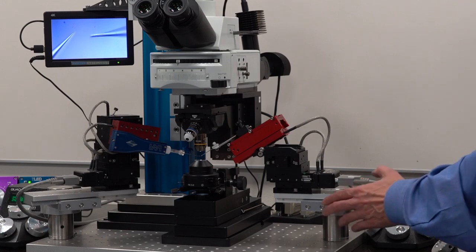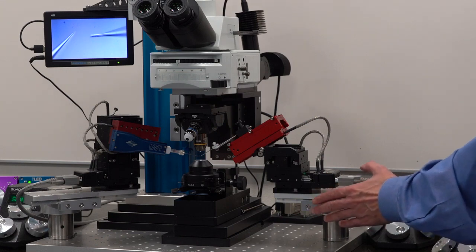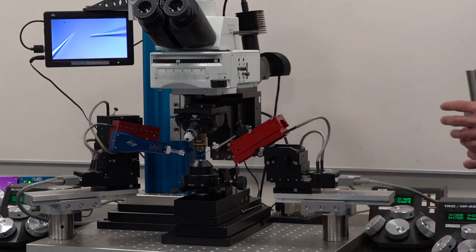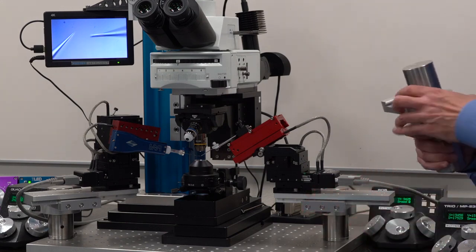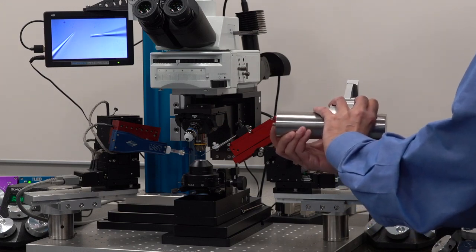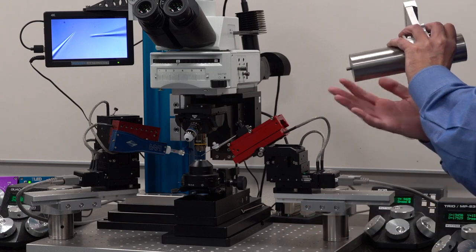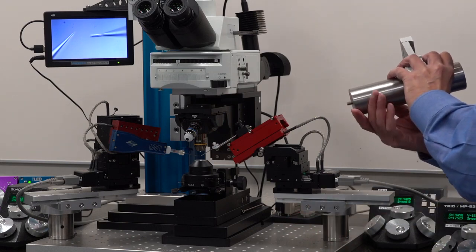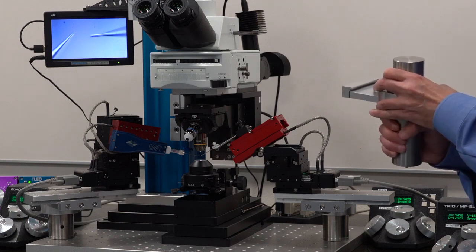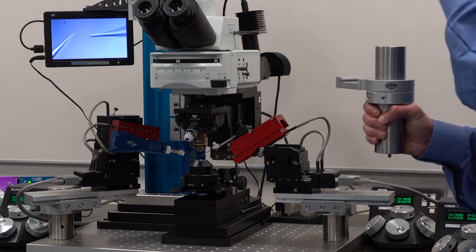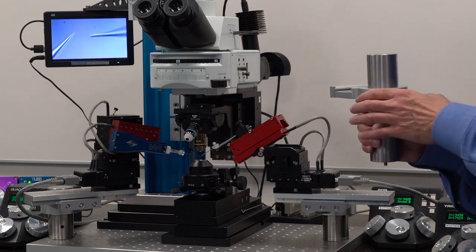So in this setup, I am using what we call my newest stands. They call the MT-95s. Very, very simple stands. They are as easy as putting this set screw into a table. We make it both in metric M6 or quarter 20 for an SAE table. The thing that we like about these towers that I've maintained all three degrees of freedom.